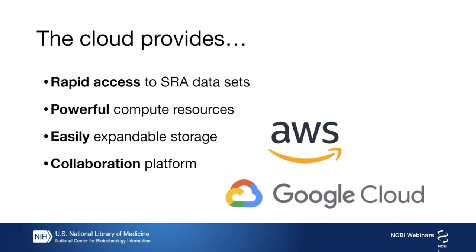You can have your collaborators who might be in different parts of the world log into the same system, run the same pipelines, and look at the same results whenever they want. You don't need to share those results individually anymore, since everybody can log into the same server.